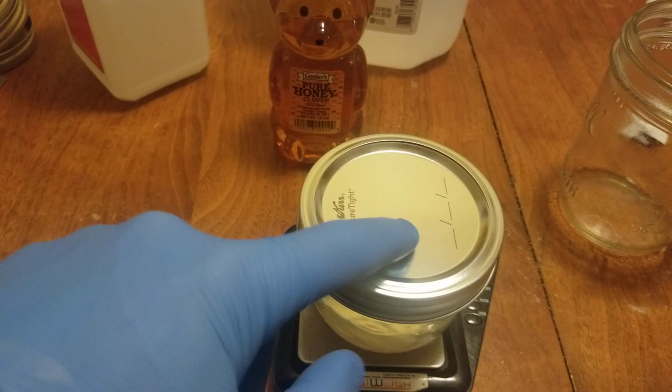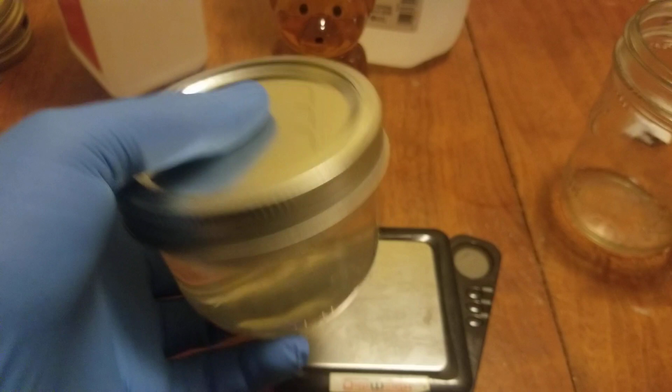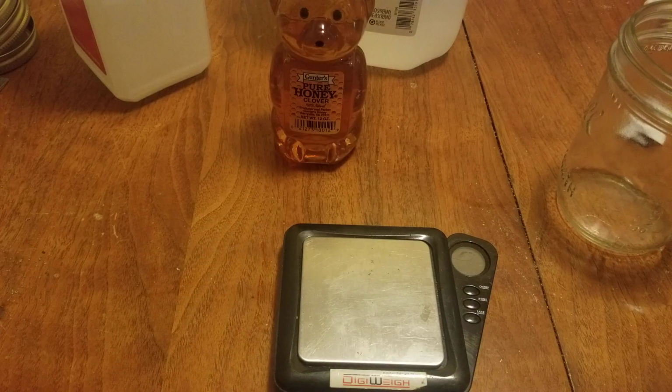The way you can tell it's pressure cooked is if the top stays down when you take it out. If it stays down, then you know it's been successfully pressure cooked. If not, then obviously it's not pressure cooked. That's another reason I like to not drill holes in these, so I know 100% for sure. So I'm going to put these in the pressure cooker for about 10 to 15 minutes, and I will meet you guys back then.